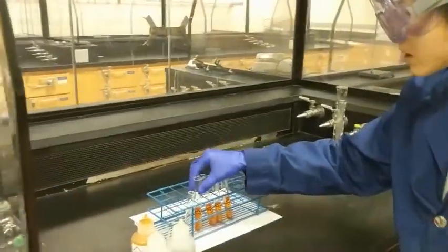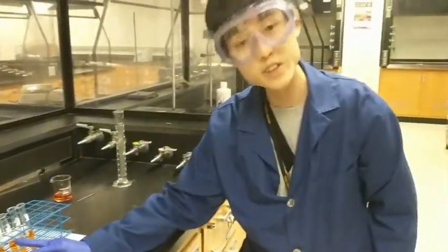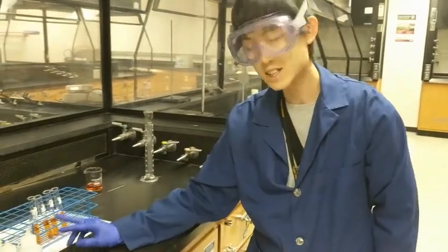Okay, now the first test tube is going to be used as a reference. So we are going to just leave it in the test tube rack.